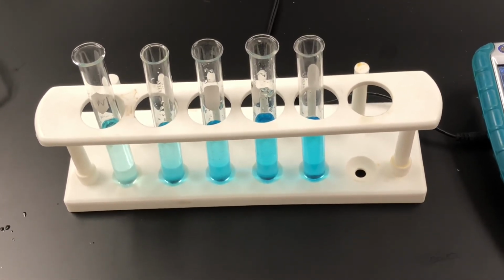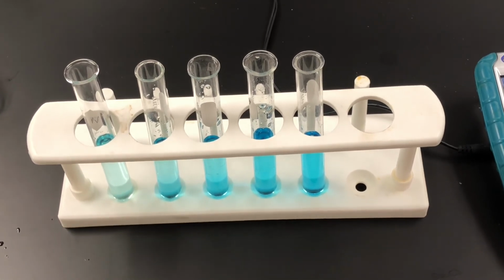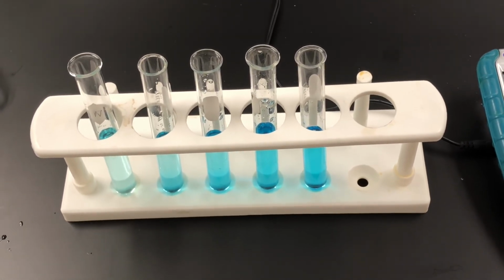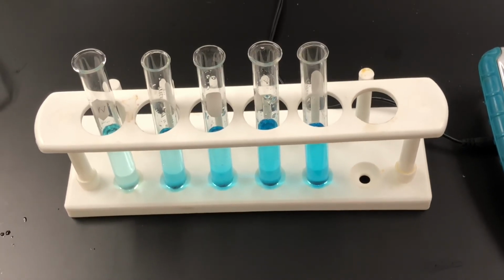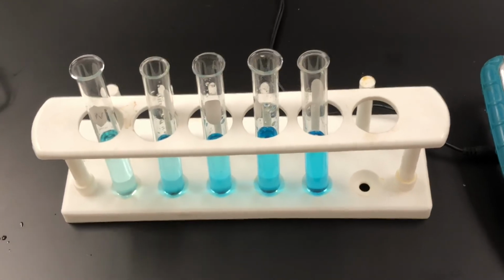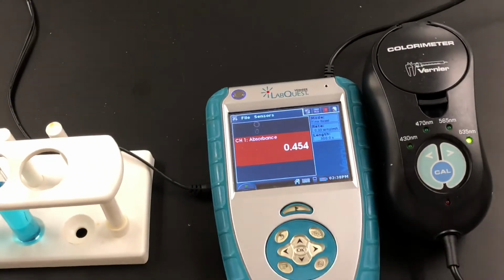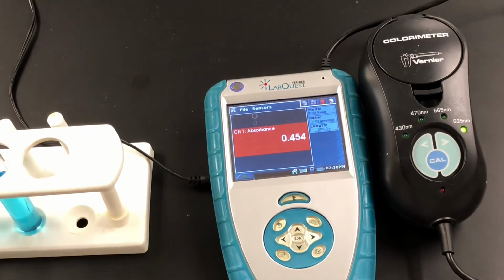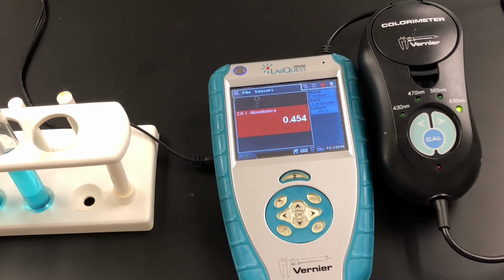And when we insert a line of best fit, we can ask it to show the y equals mx plus b equation. So you should be able to use that y equals mx plus b equation to solve for the unknown concentration when it has that for your absorbance. So if you guys have questions, let me know. Hopefully this is quick and easy for you.